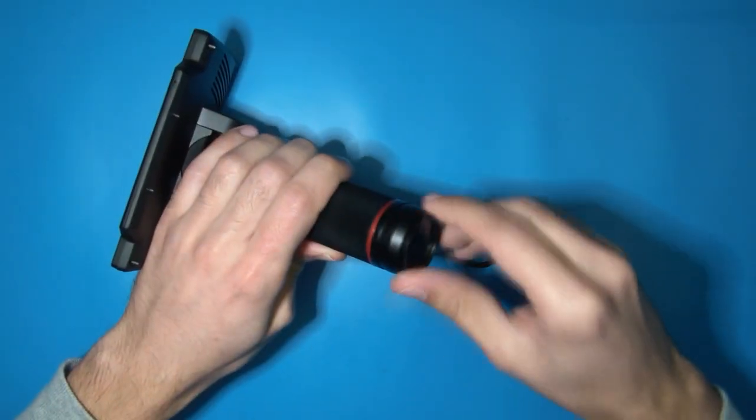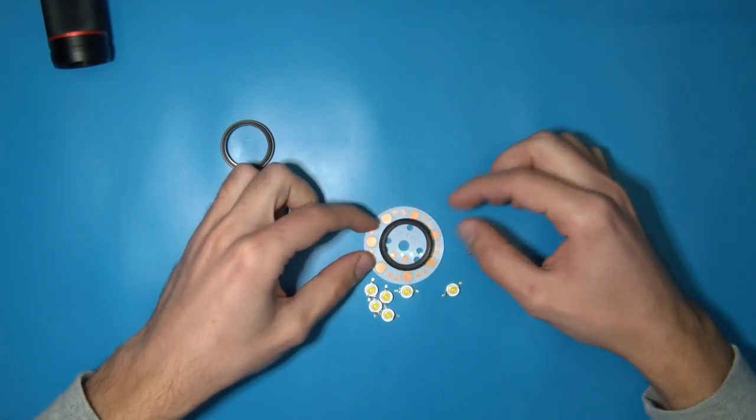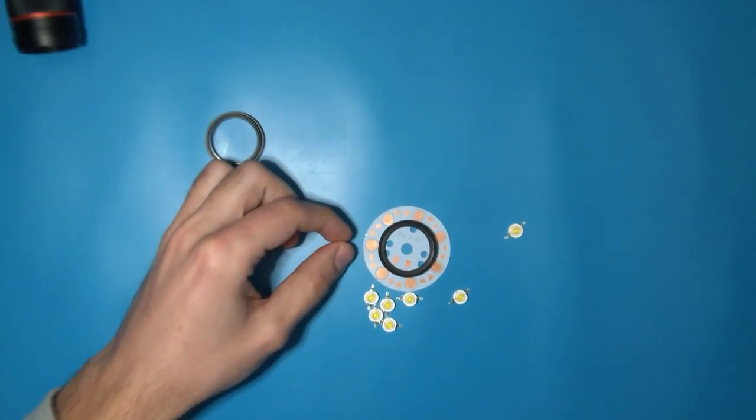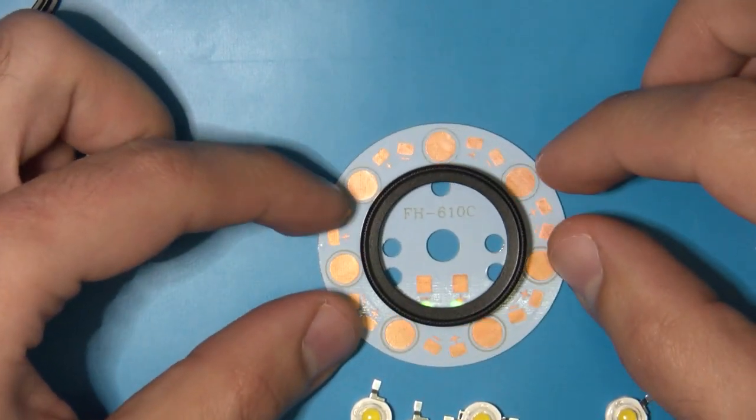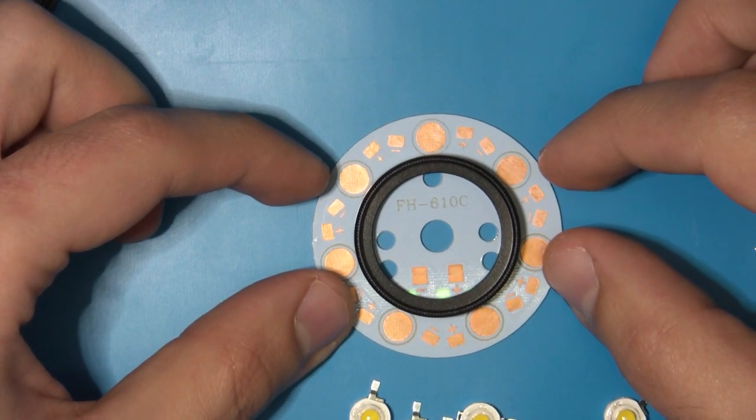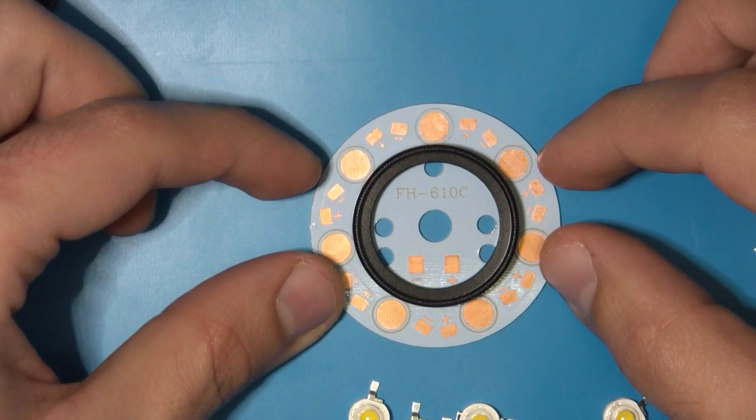I started by removing the lenses, which are identical on both models. I then put them on top of an LED aluminum substrate PCB and although it is a tight fit, I realized that if I soldered the LEDs all the way to the edge, I could fit the lens in the middle.